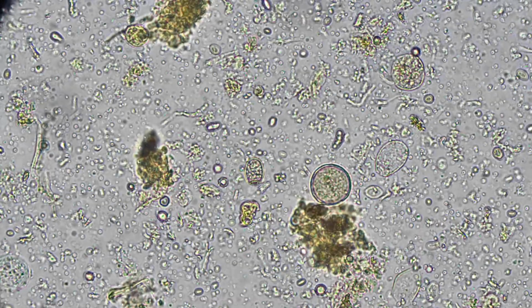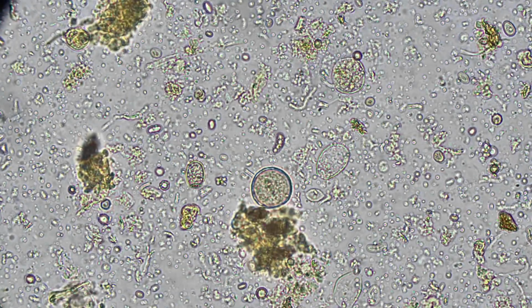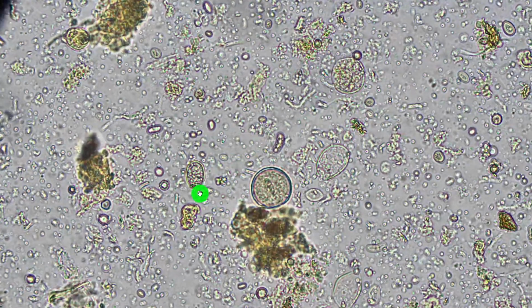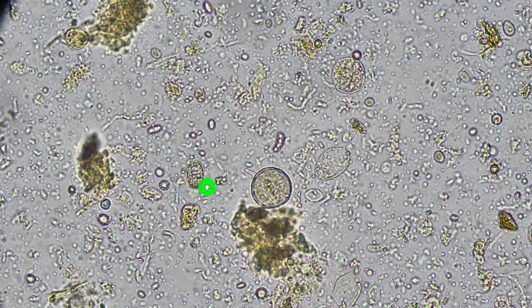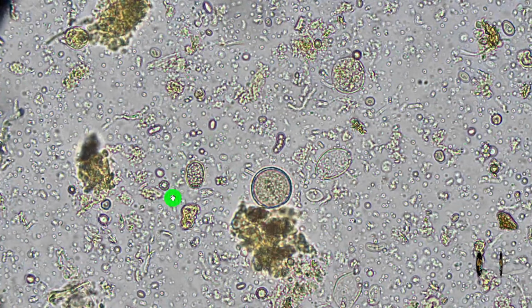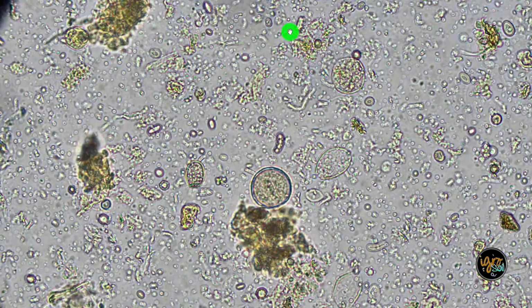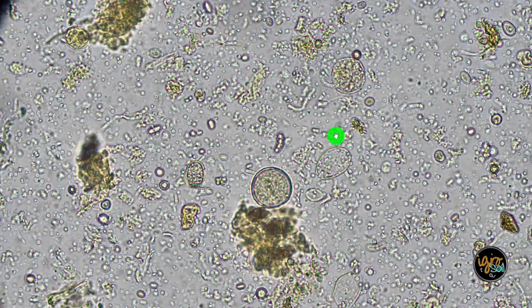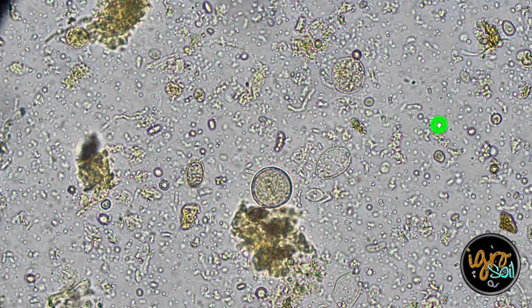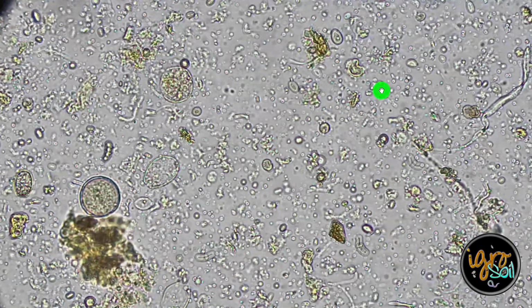Tons of biology. Tons of amoeba. This is testate there. That looks alive. That was a testate, or I don't know if it's alive. It's still, the body of it is packed, right? It's got a lot in there. When these things are usually dead, or they leave the system, I don't know what happens there. Sometimes they stay in there, sometimes they die. They're very sensitive, I believe. That's why you don't find them too often moving.